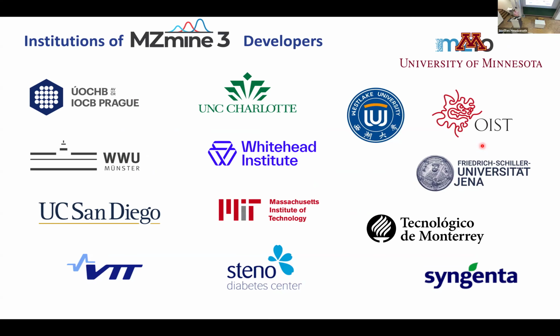One thing that I would like to really highlight here is that MZmine is really a community effort, and we don't develop MZmine alone. A lot of institutions have contributed code. So you shouldn't be scared if you have a really nice idea, we can help you implement it. If you don't know how to code, we can probably also make something work if you have a student. I'm just saying we can't do everything; it's not possible for us to implement every good idea, but we're always open for new contributions.